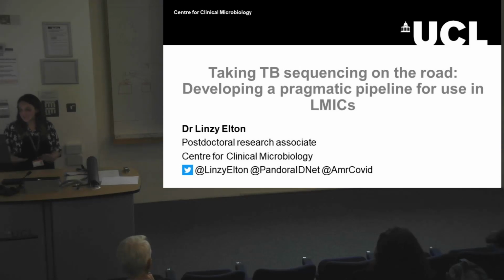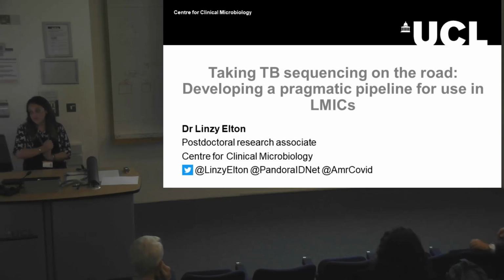Hello, I'm going to talk a little bit, following on from the last talk, about looking at relapse and reinfection and sequencing. We've been developing a TB sequencing pipeline, specifically for low and middle income settings and resource-poor laboratories, which have a slightly different way of doing things and a way to build it up.